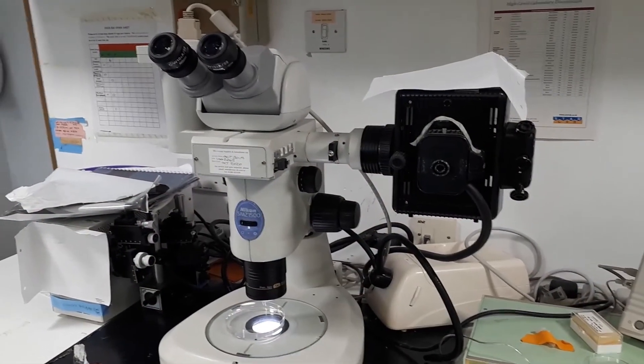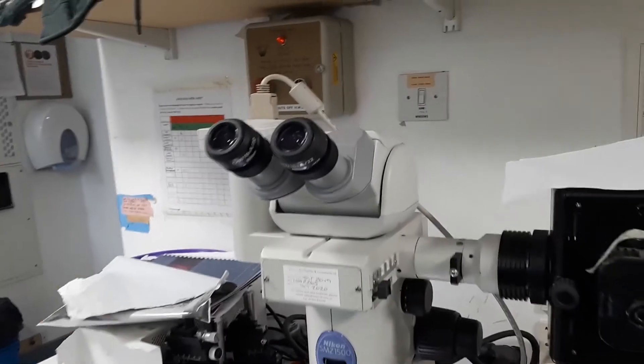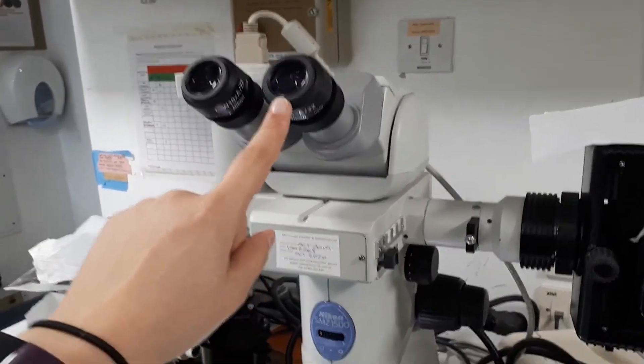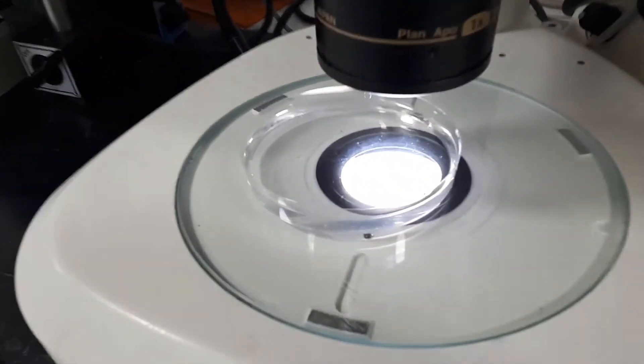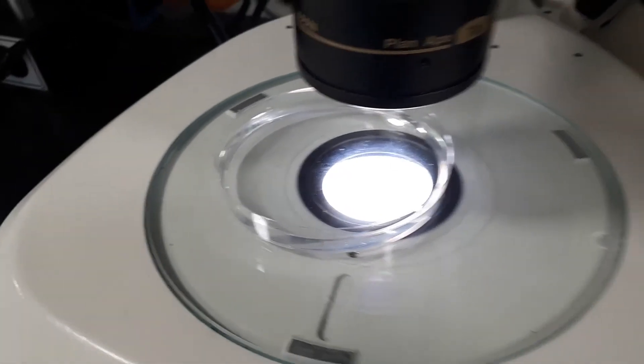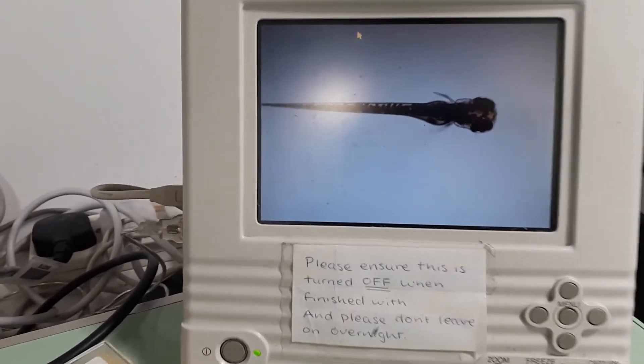So this is a different kind of microscope. Instead of looking down the eyepiece to see the fish, which is just at the bottom of the microscope here, this microscope is connected to a camera. So we can see the fish on this screen.